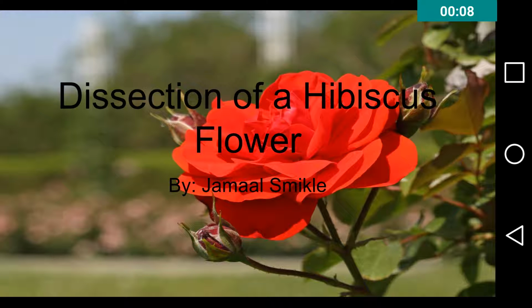I'll be discussing the location, structure, and function for each part of the flower, as discussed in lecture chapter 22, which by the way is on page 668 if you want to go check that out. Alright, so let's begin. I'll actually start the opposite way, and I will do the actual functions and the structures last, because they're in a separate video.